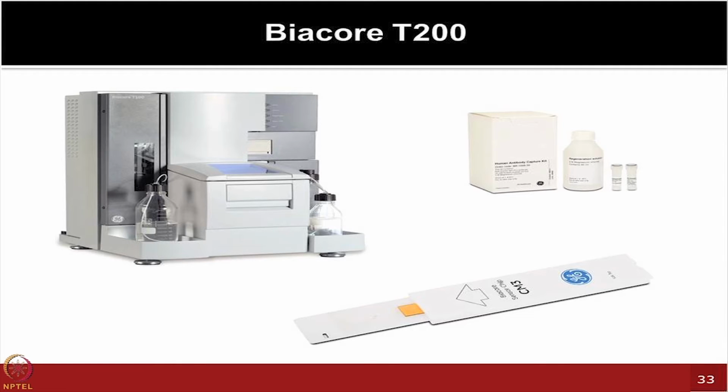Nevertheless, these kinds of technologies give you very precise data, but they're very costly, considering how much it costs to do these experiments. So many times, if you are in discovery development mode and you have hundreds of compounds or libraries to screen, this may not be the best platform to start with, because you are limited by how much cost you have to screen that large a number of compounds.